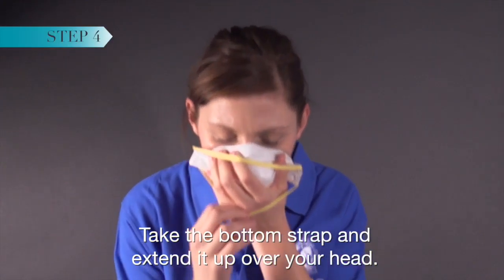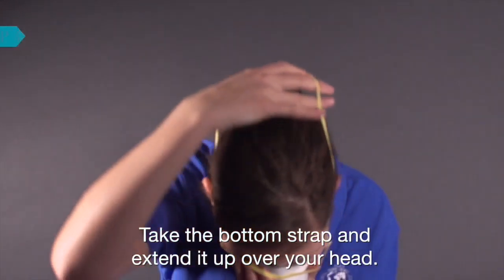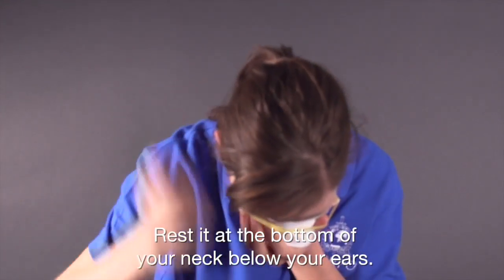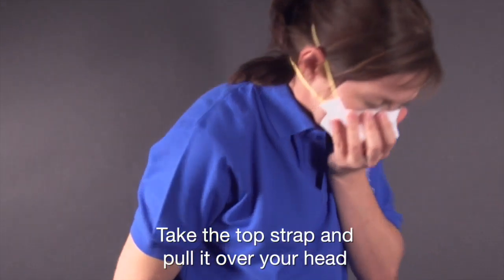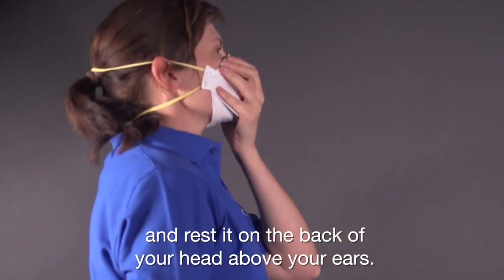Take the bottom strap and extend it up over your head. Rest it at the bottom of your neck below your ears. Take the top strap and pull it over your head and rest it on the back of your head above your ears.